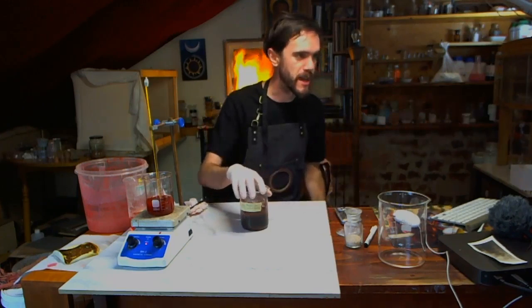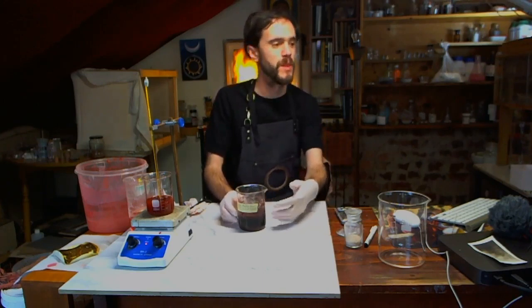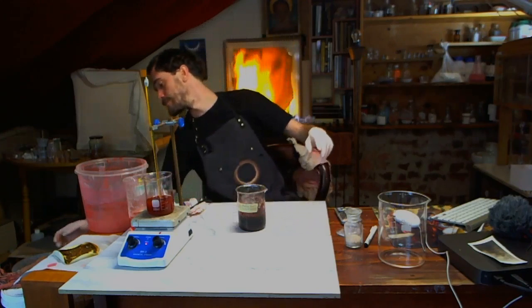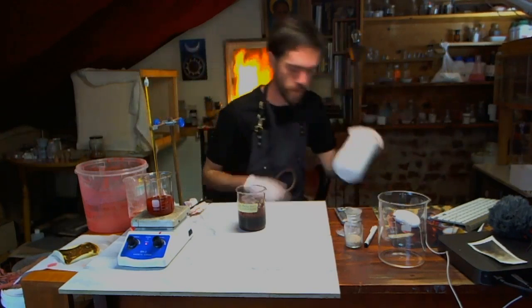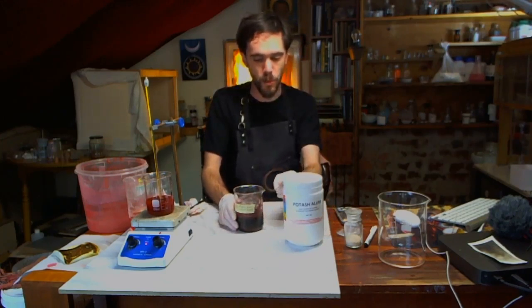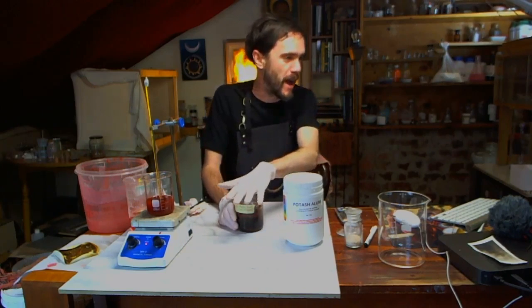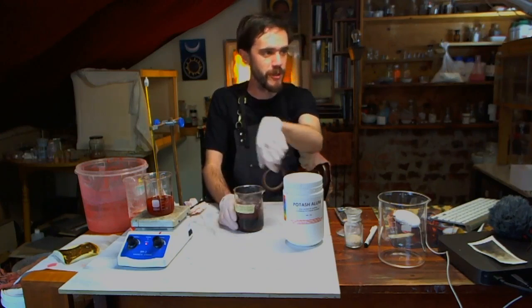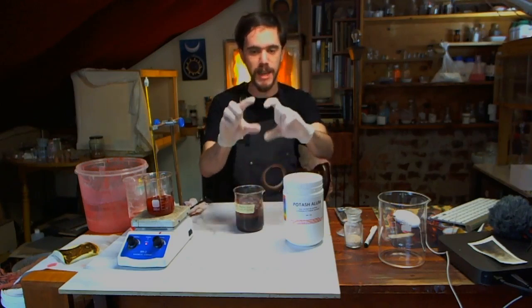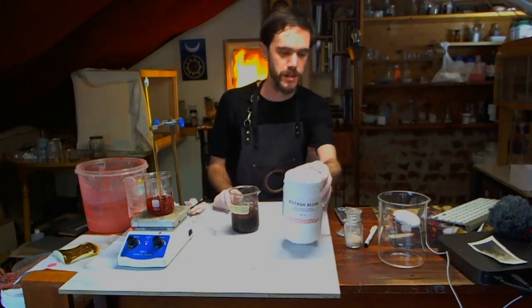The process then goes on to say you wash the root material until there's no sulfate left in it, and then we take a boiling solution of potassium alum. Where's my alum? So we'll make up a boiling solution of the alum, and then we will put the root material that we've taken out of here into the boiling solution of alum, and we'll let that stand for 20 minutes, then filter it and take out the root material, wash the root material clean, and take the liquid that we've got. So let's get to that stage and then we'll explain the next bit so I don't overload you with information.